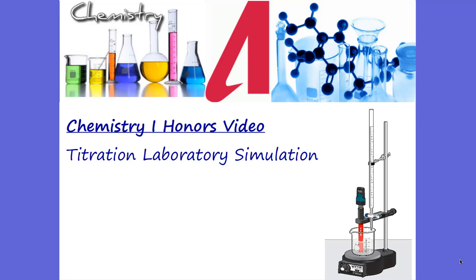Hey, this is Mr. Aden. This is Chemistry 1 Honors Video, and we are doing titration laboratory simulations today. We're going in the laboratory. We're going to be doing three different labs.